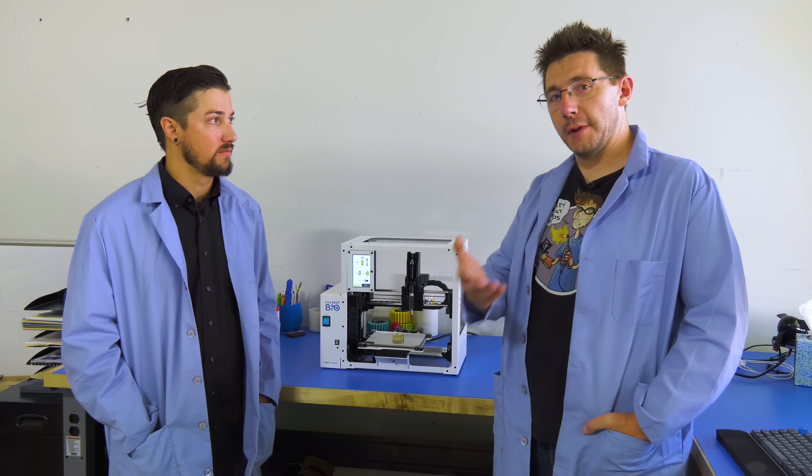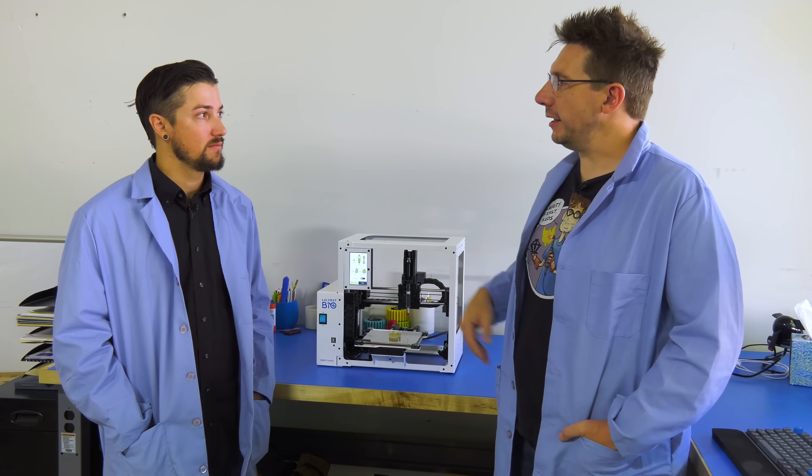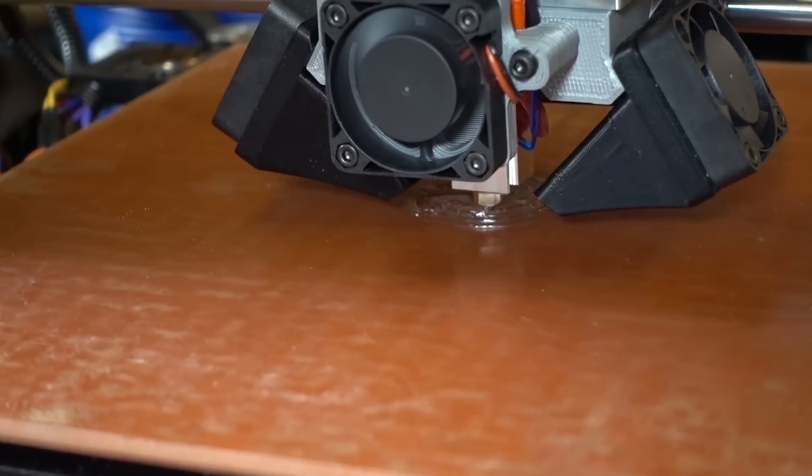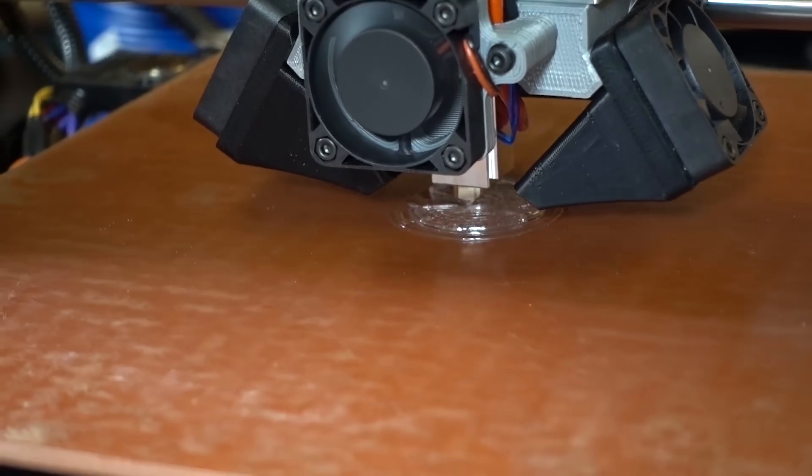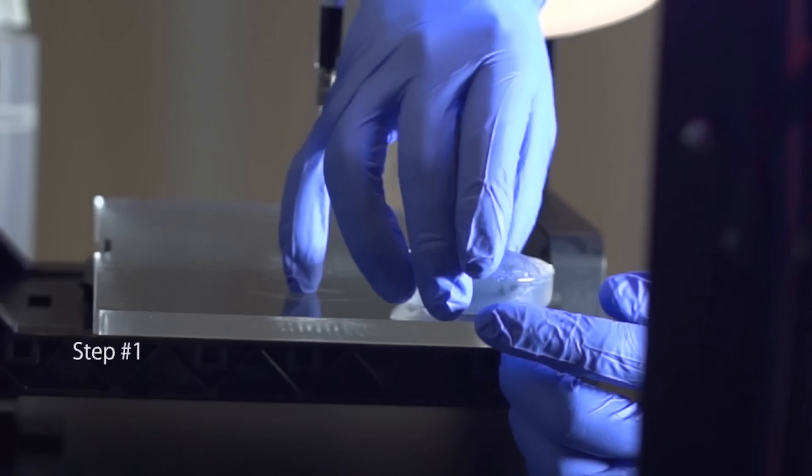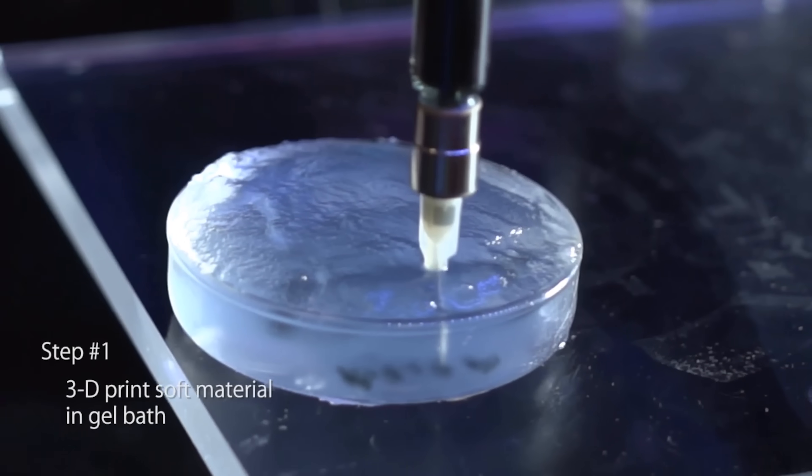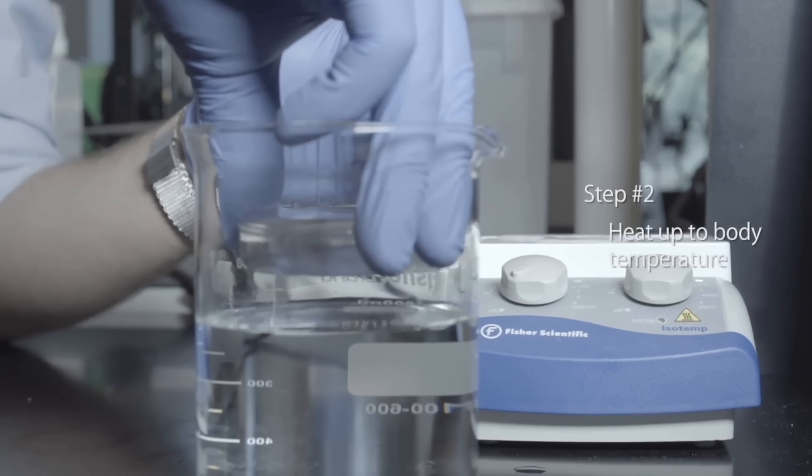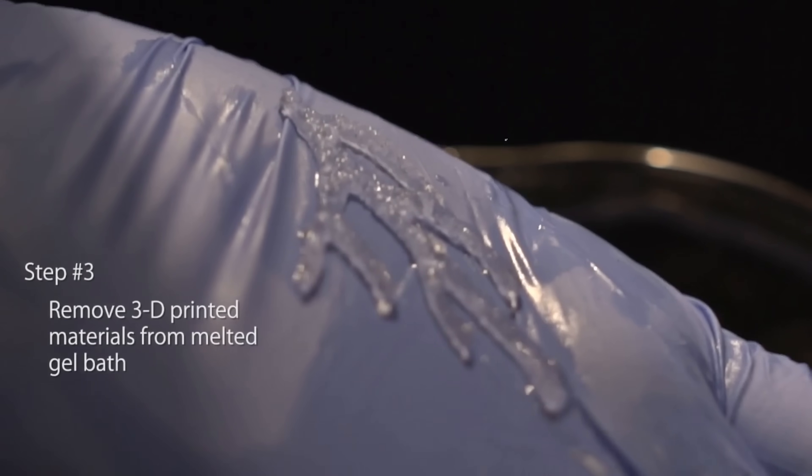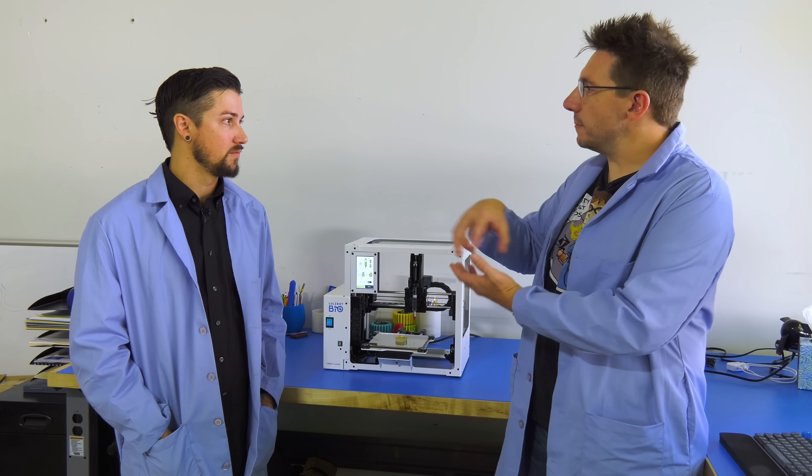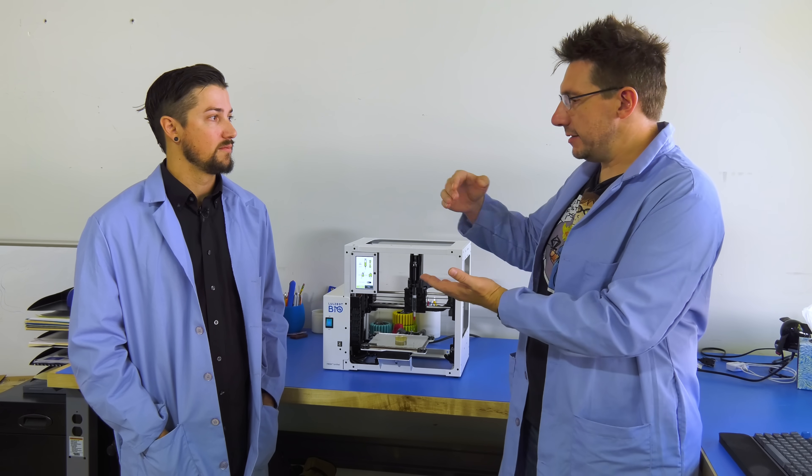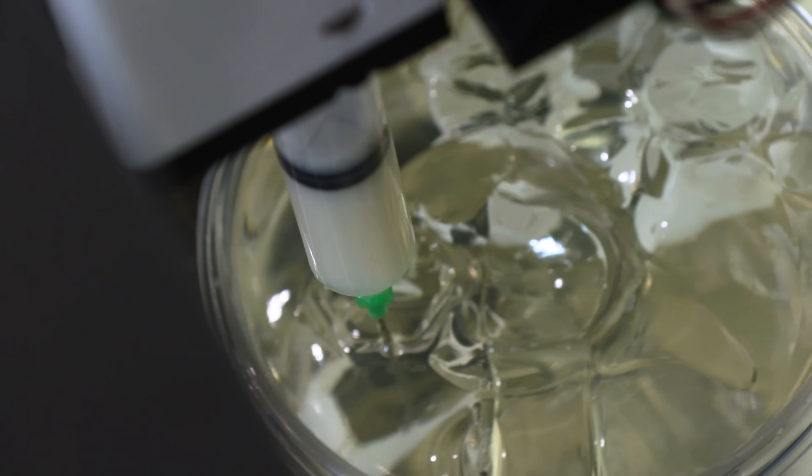So then when you have this material here, and I think you said that you heat it up and it releases, meaning that it's a liquid, you can take the part out. Then do you cure the part within the solution, or do you take it out and cure it? You will cure it within the solution. And so sometimes you can mix the material with a pH solution to change the pH, and things like collagen will cross-link through that process. Okay, what does it mean? Now you're going to have to help me out here, because there's some pretty big words here. I want to make sure I understand, and my audience understands as well. What do you mean by cross-linking a collagen?